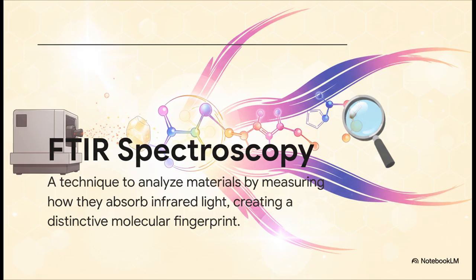Now, yeah, the name sounds a little intimidating, but the idea behind it is actually beautiful and simple. We shine a special kind of light, infrared light, on a sample, and then we watch to see which parts of that light get absorbed. The pattern that comes back is totally unique to that molecule. It's the molecular fingerprint we've been talking about, and it's our key to unlocking its identity.